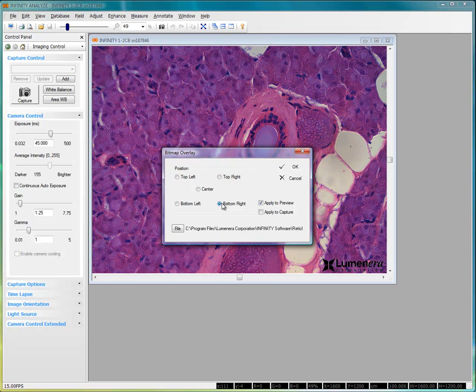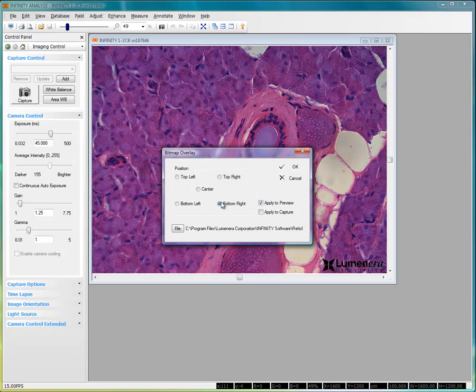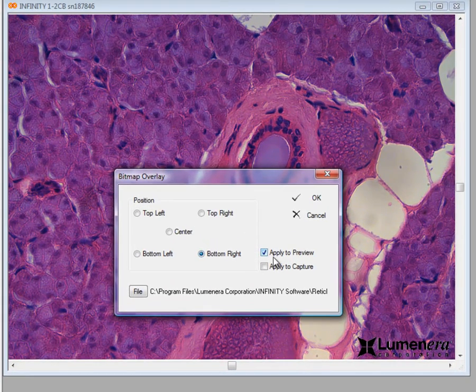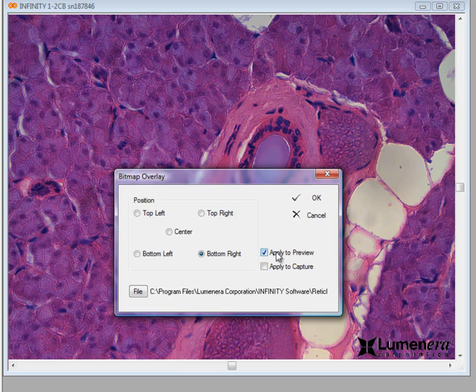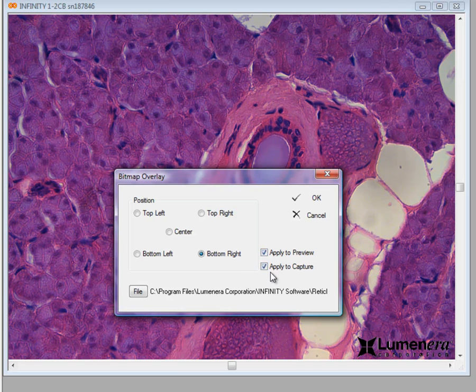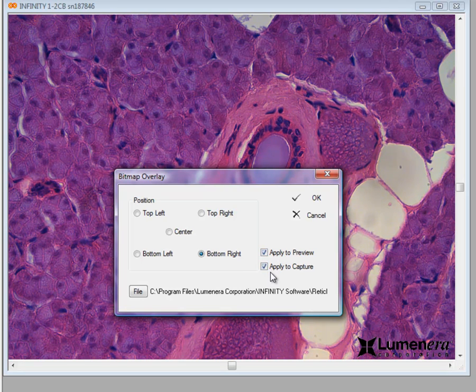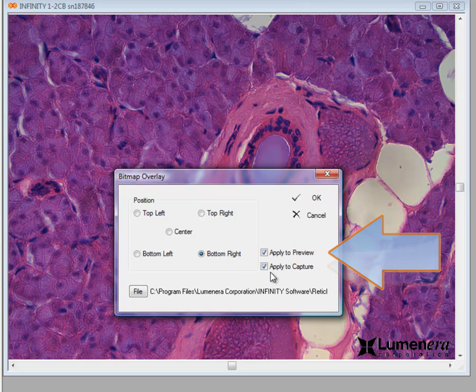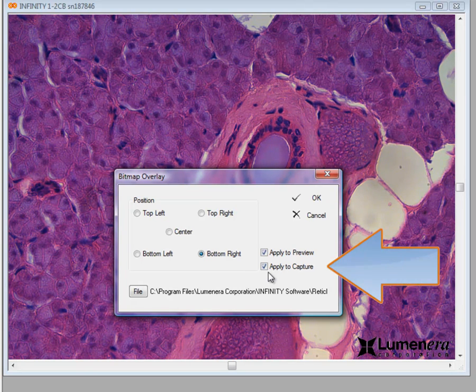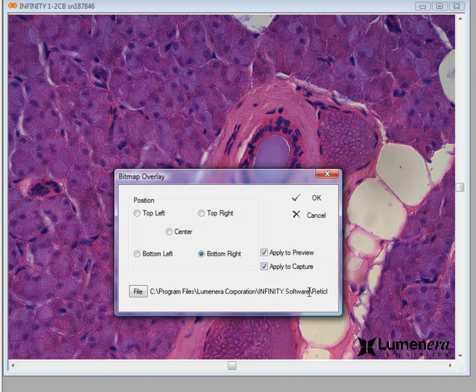If you want to display a particular date stamp or a project name, simply add it into a bitmap overlay file, and it can be applied to each image that is captured on that particular day, or on images related to a specific project. You'll also notice we have options here to apply the bitmap overlay to the live preview, and to apply it to capture. You can choose either one of those, or both.